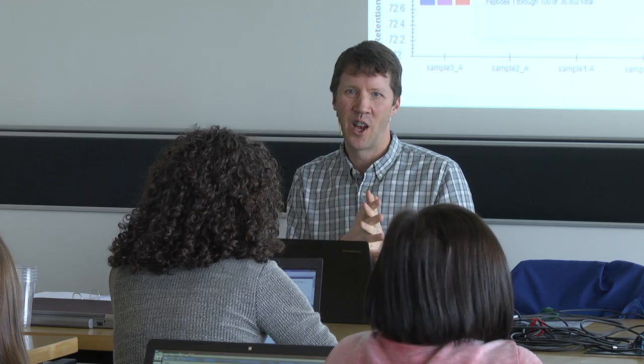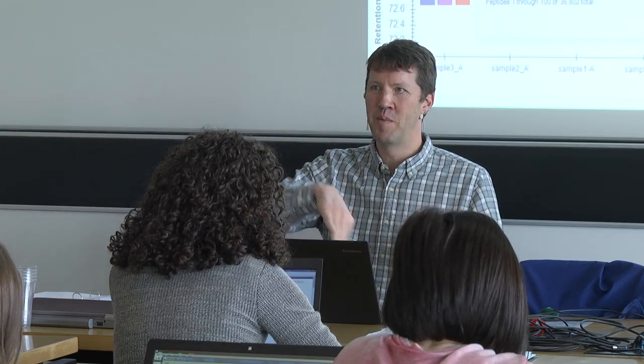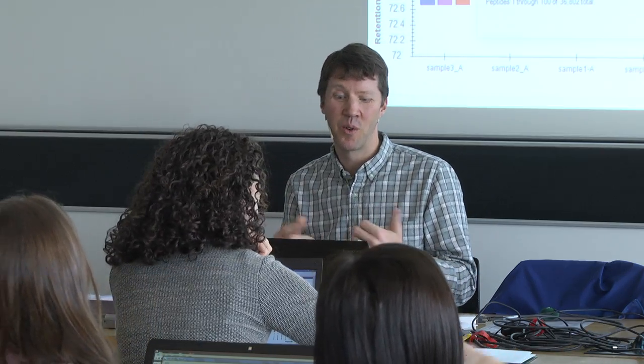other ones. And so we moved to a system where we actually pick the best scoring spectra, and then if we have multiple at that scoring level, then we'll pick the one with the highest intensity. And that does a really good job in PRM data of picking the one at the apex of the peak. So that's how we've tested it.